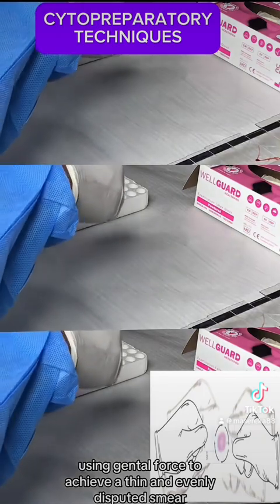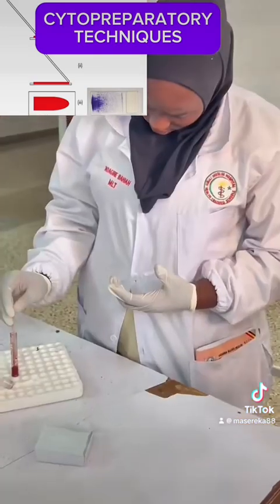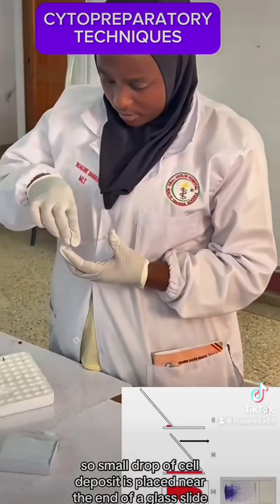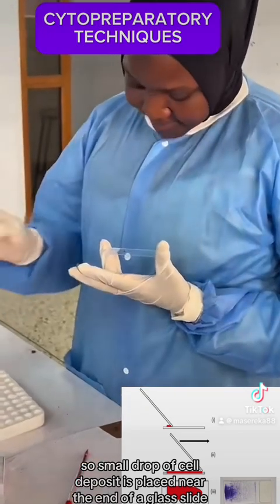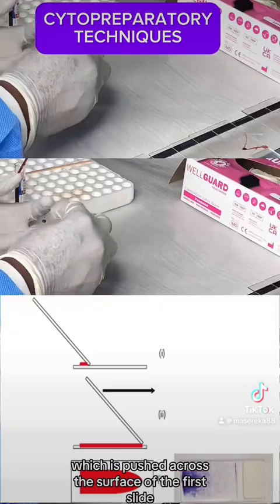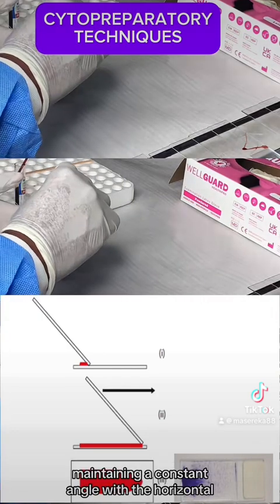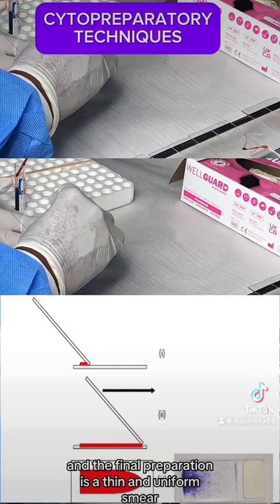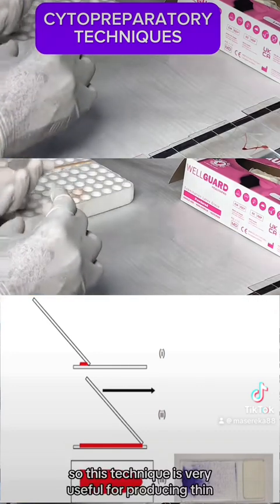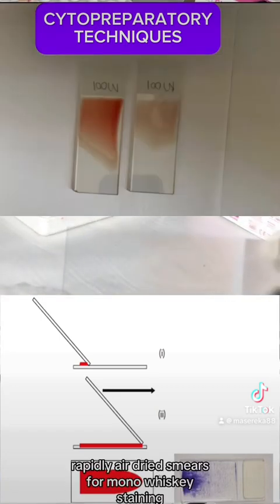evenly distributed smear. Number 5, blood smear technique. So a small drop of cell deposit is placed near the end of a glass slide, which is pushed across the surface of the first slide, maintaining a constant angle with the horizontal. And the final preparation is a thin and uniform smear. So this technique is very useful for producing thin, rapidly air-dried smears for Romanowsky staining.